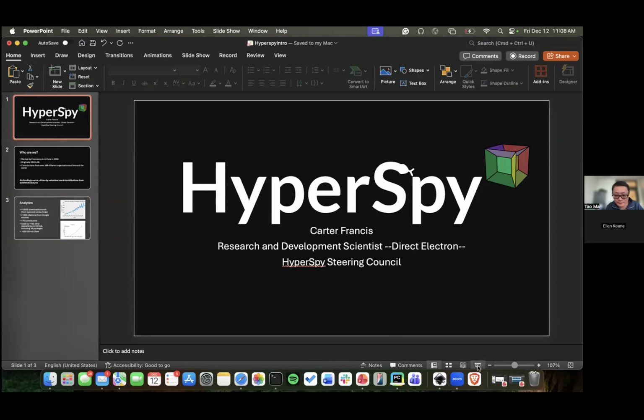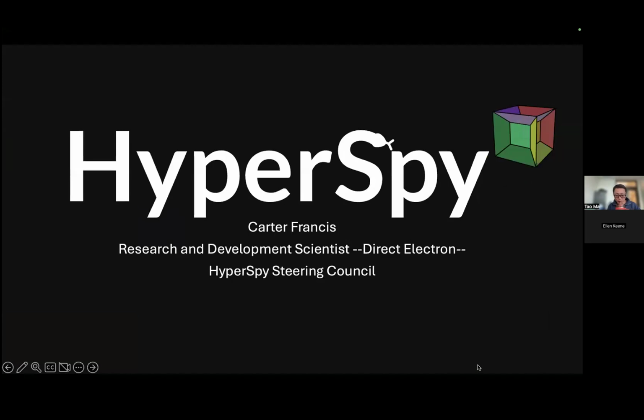So just a short overview, because a lot of the time what we really care about is how to actually use the package. My name is Carter Francis. I work now for Direct Electron. We make detectors for anything from cryo-EM to materials science, all of that sort of stuff. But today I'm going to be talking about this open source package, HyperSpy.